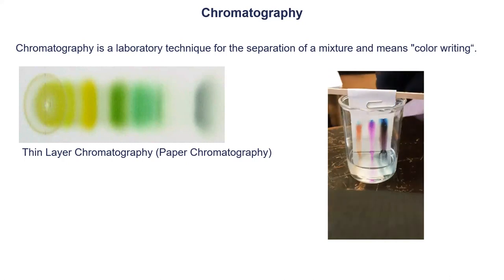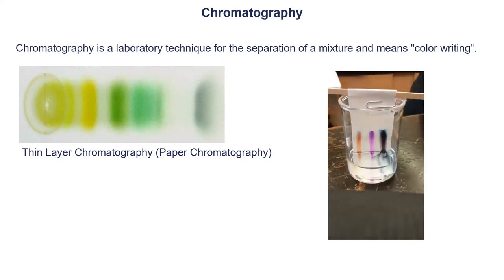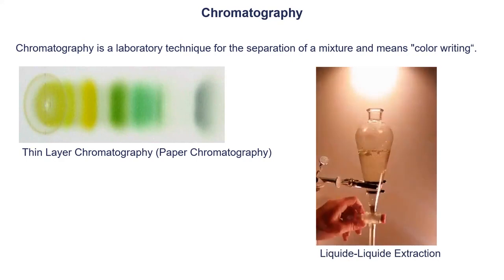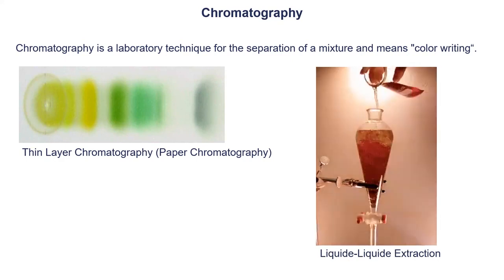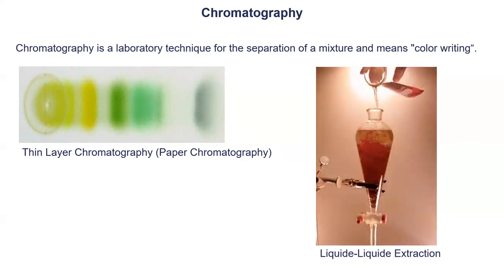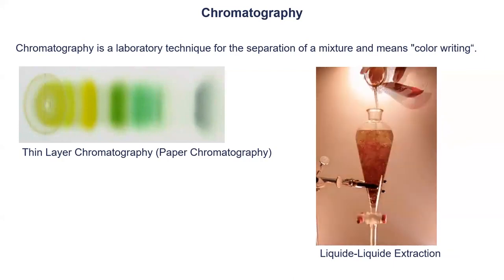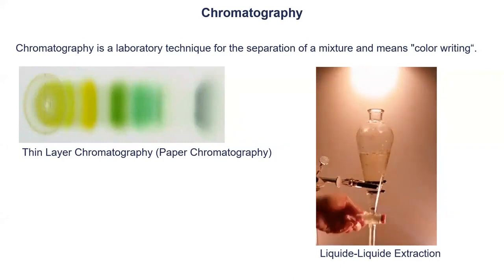This is also how it actually looks. So we see the solvent is going and then it's taking the compounds, based on their interaction, higher on the silica gel or lower. Another step to separate compounds is liquid extraction, for example. So it depends how the separation works, or how it acts in the lipophilic or in the hydrophilic way. So if you have an organic or water phase, how will it actually separate in your different phases? And then based on this, you can separate different compounds.